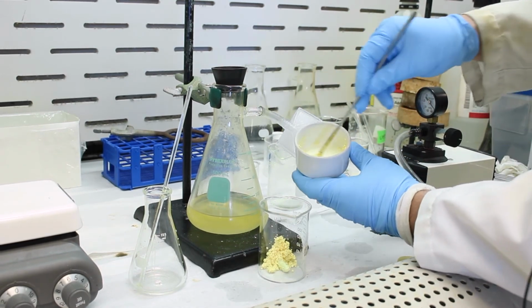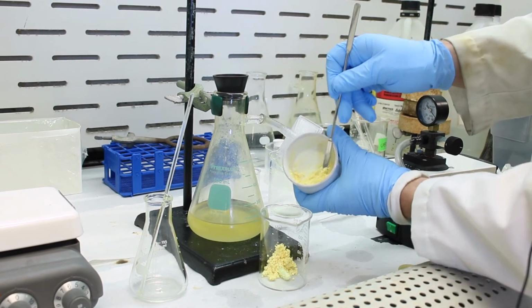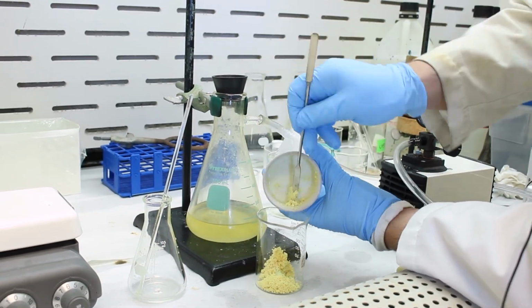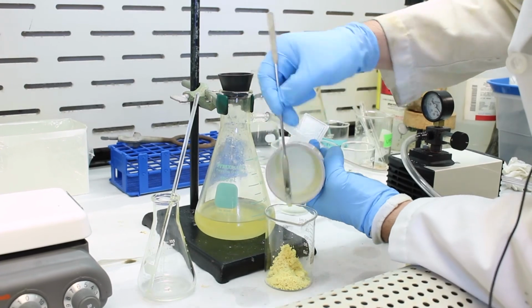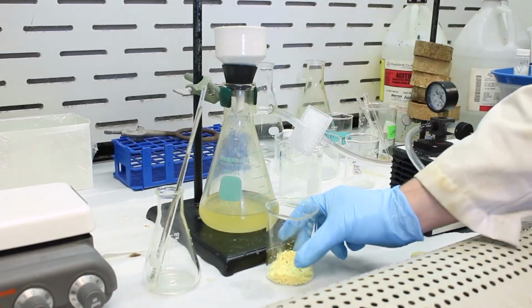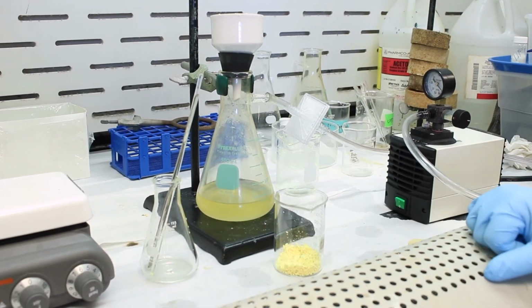So yeah, it's kind of pasty, so a lot of water. Okay, so there is our crude product. We'll take the stir bar out and then we're going to recrystallize it.